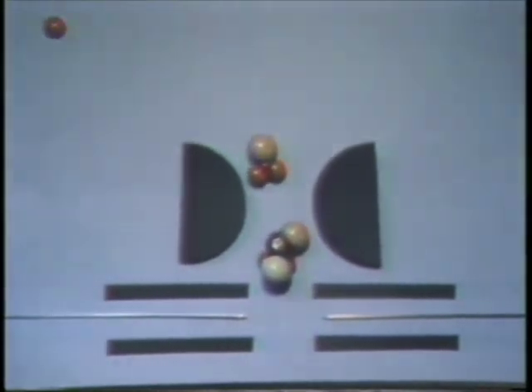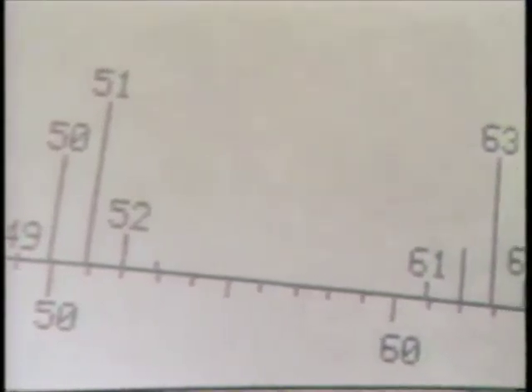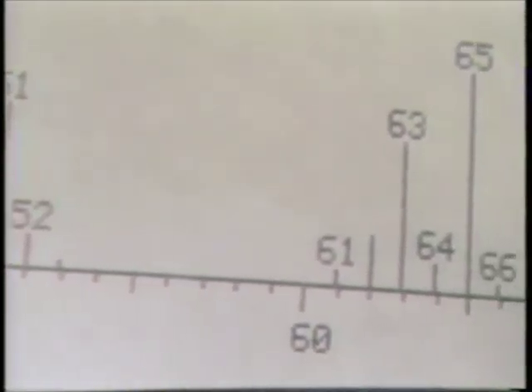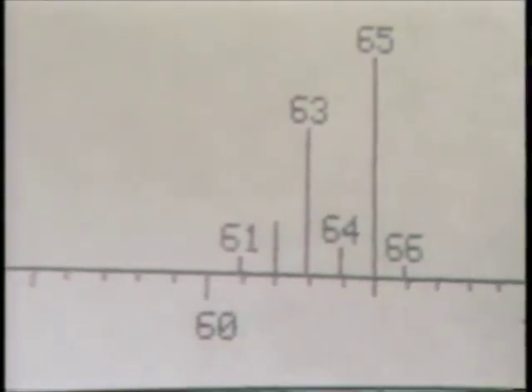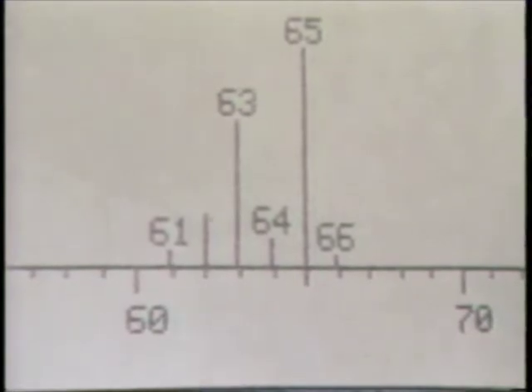An appropriate detector and recorder then chart the mass of these fragments, a graph of which is unique for each substance. So while the mass spectrometer cannot separate mixtures, as can the gas chromatograph, an identical mass spectrograph of a known and unknown definitely proves the two are identical.